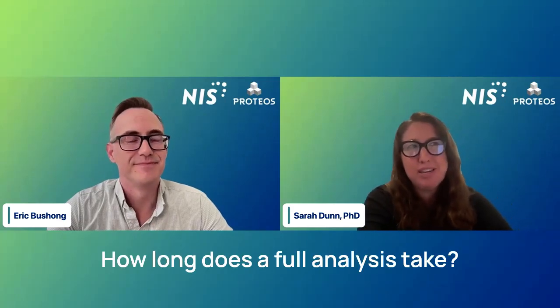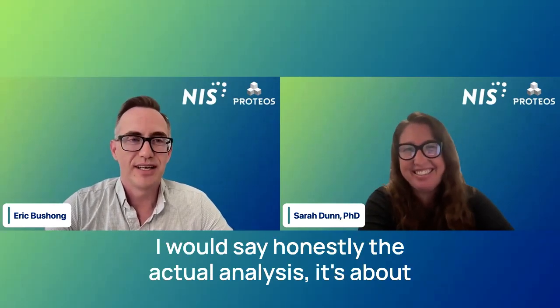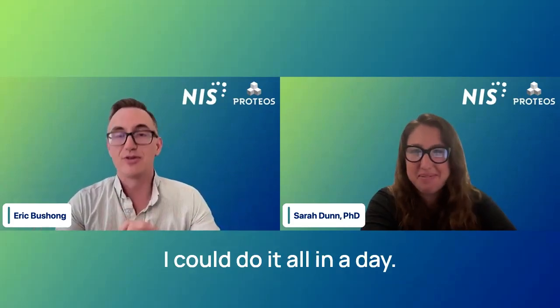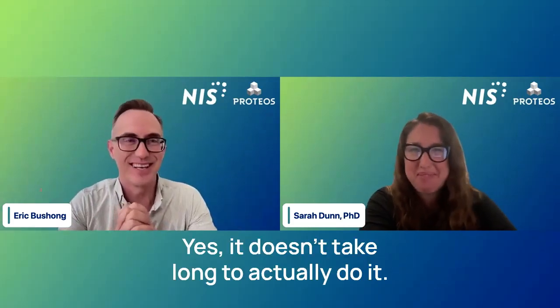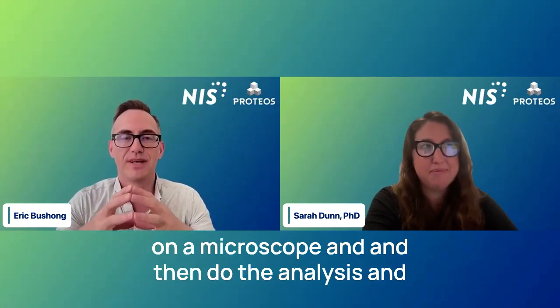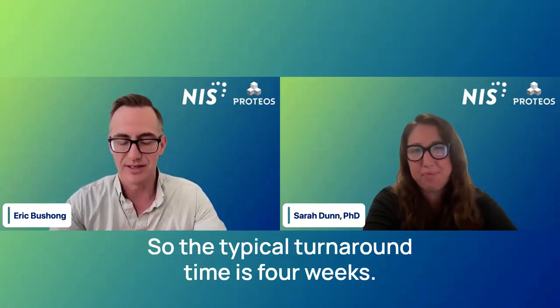How long does a full analysis take? I think I just answered that question. I would say, honestly, the actual analysis, I could do it all in a day. It doesn't take long to actually do it. It's a matter of being able to schedule the sample on a microscope and then do the analysis and put the report together. So the typical turnaround time is 4 weeks.